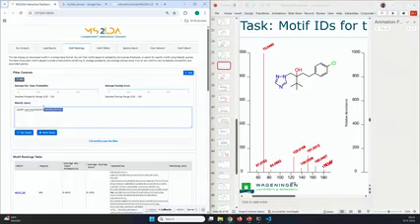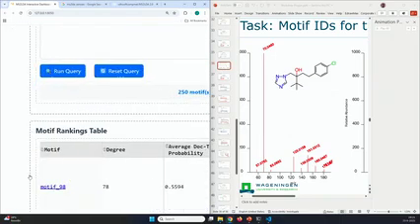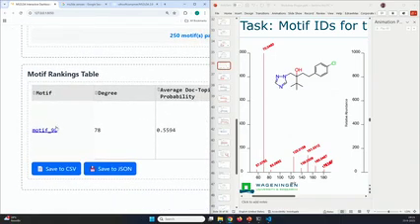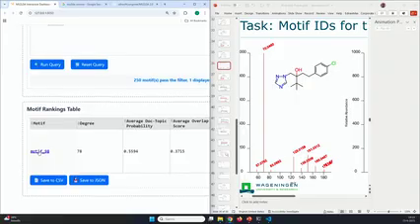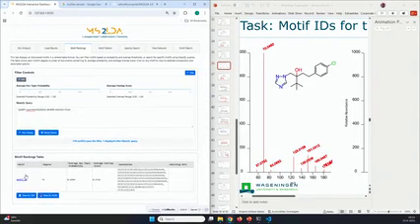Is that typed correctly? Should be correct. So then let's just type 70.04. This is the biggest fragment here. One query, we get one master motif, right? And as I said, the easiest way to explore it is to just click on it. Okay, it doesn't want to.